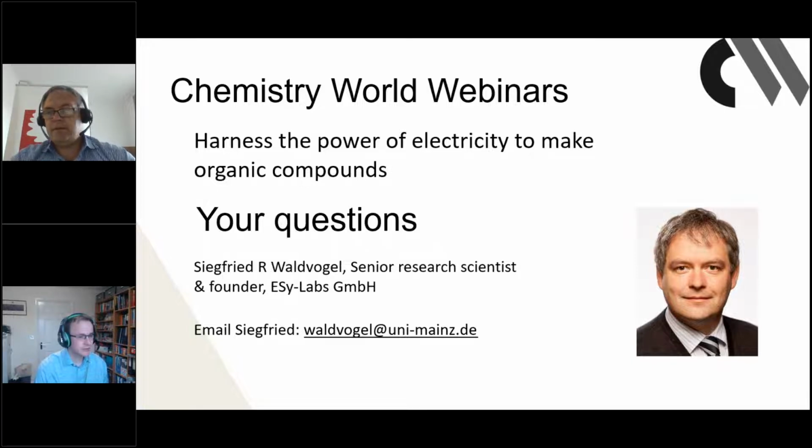So I'm going to start with a question from Sri Krishna, who's asked a couple of questions really around the shape of the electrodes, and does that make a lot of difference? How do you choose what shape of electrode might be better? Do you use different shapes for different applications, that kind of thing?